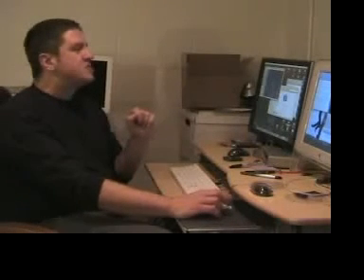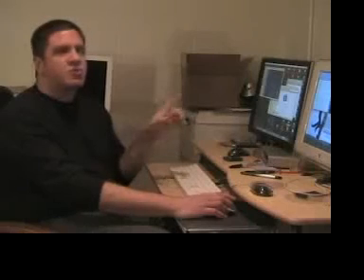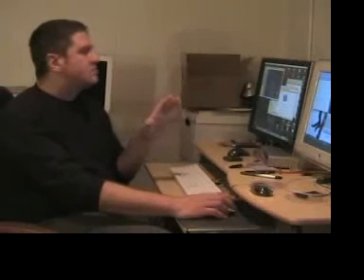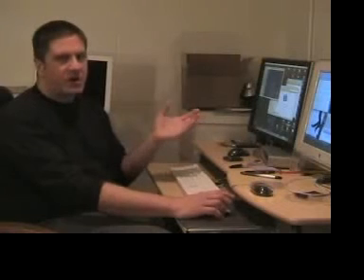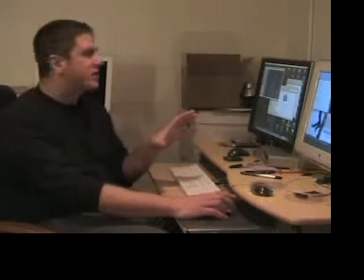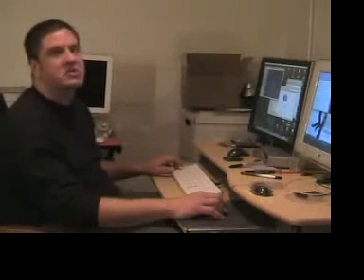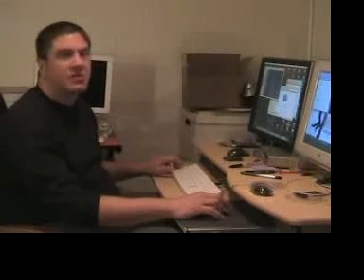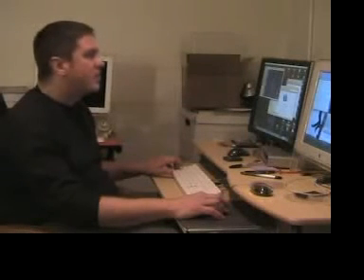All right, that next step is this. You select your marquee tool from your tool palette, which is the little marching ants square, as they sometimes say. Make sure that you've got a square or a rectangular marquee tool selected. Drag the marquee out over the reference square, holding the shift key down. This is important because that constrains your marquee tool to a perfect square, and that's important too to the next step.